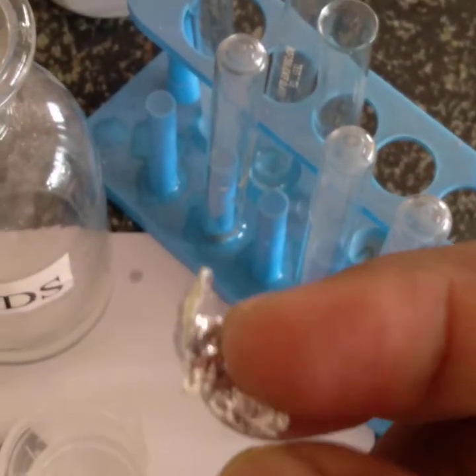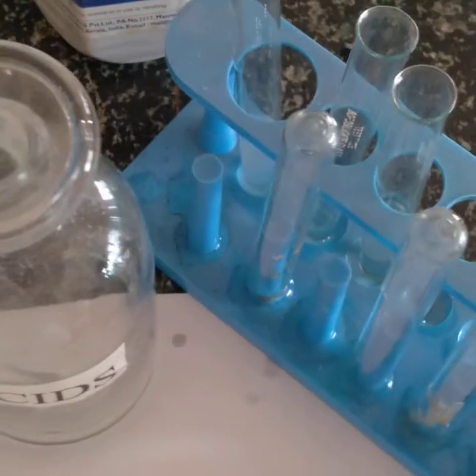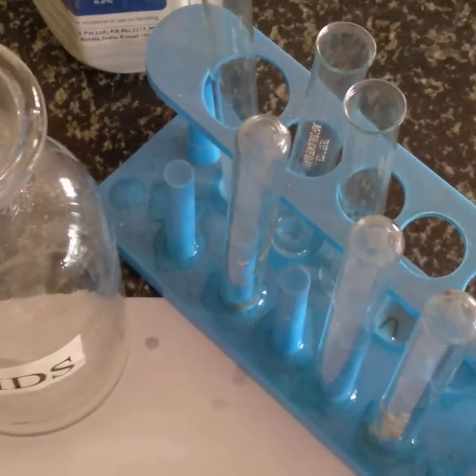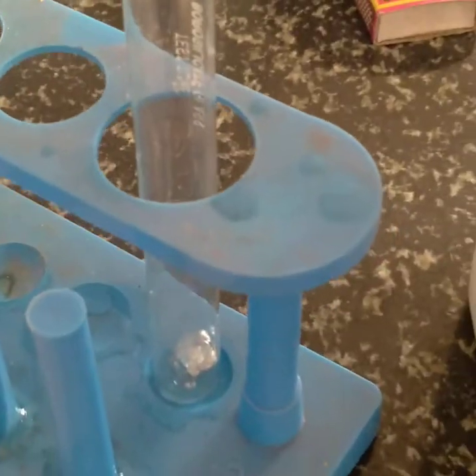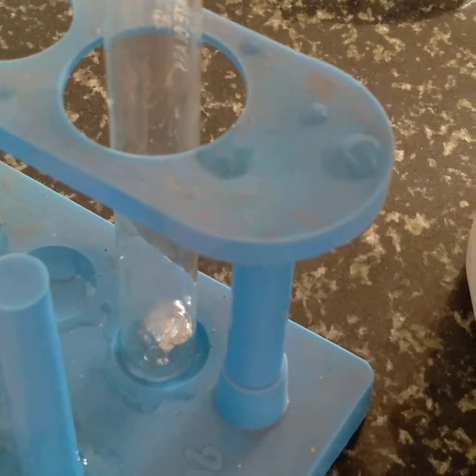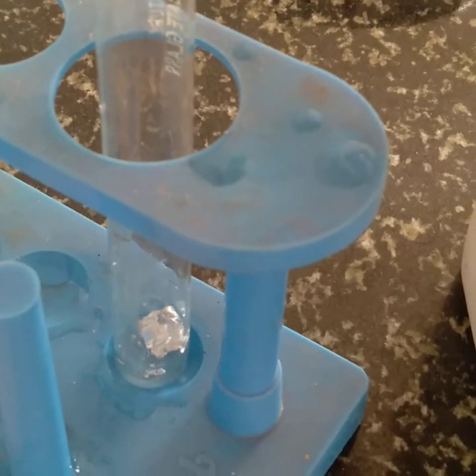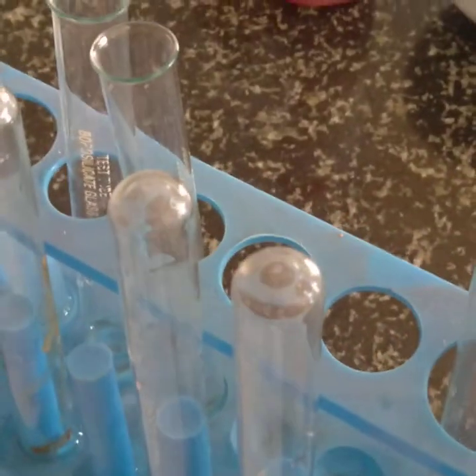So this is zinc metal. I'll take a little piece of zinc metal and put it into the test tube. Slowly I am going to add dilute HCl to the test tube containing the zinc granule. Just observe the test tube. You can observe changes.